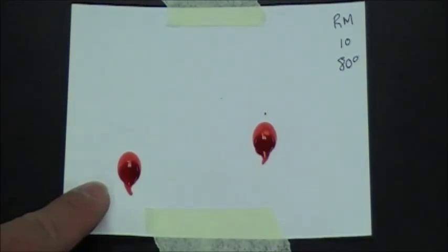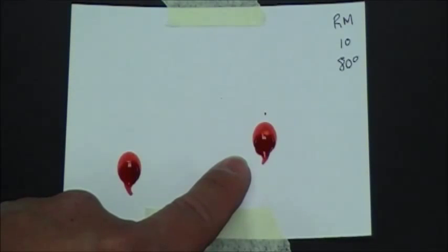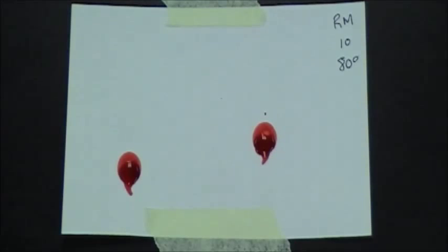The height and width measurements for drop one, you will record in trial one of the datasheet. The height and width measurements for drop two, you will record in trial two of the datasheet. Be sure to record your measurements at the proper angle at which you dropped the blood.